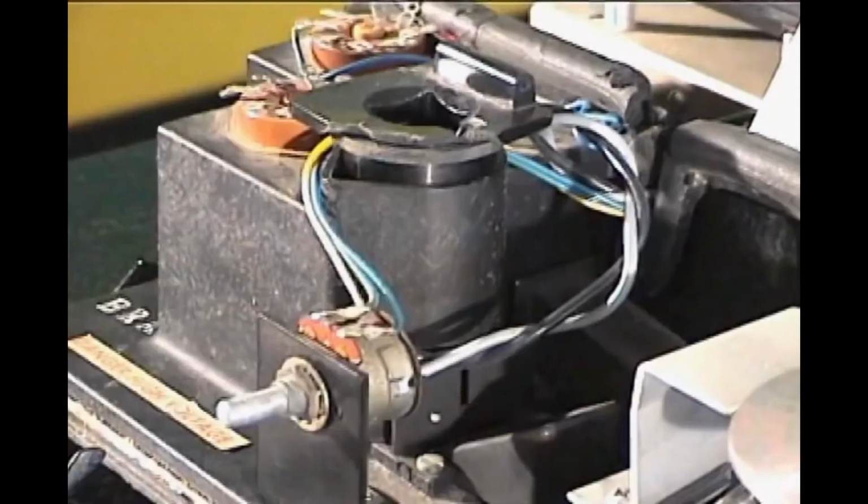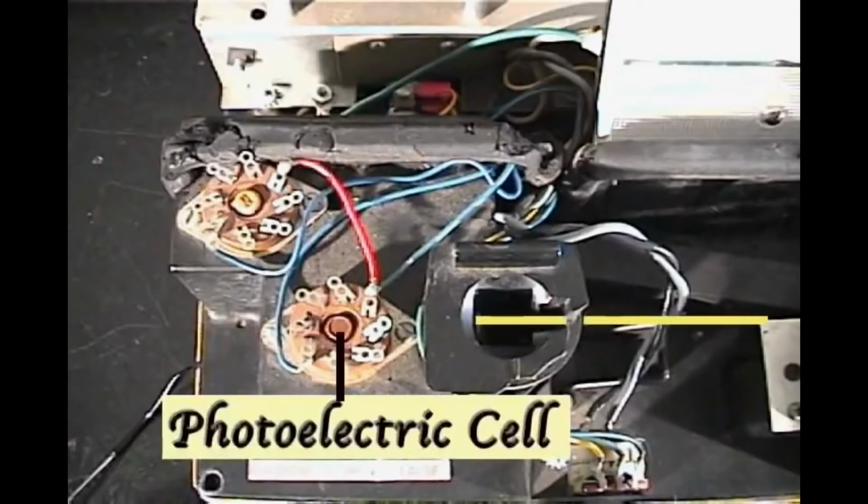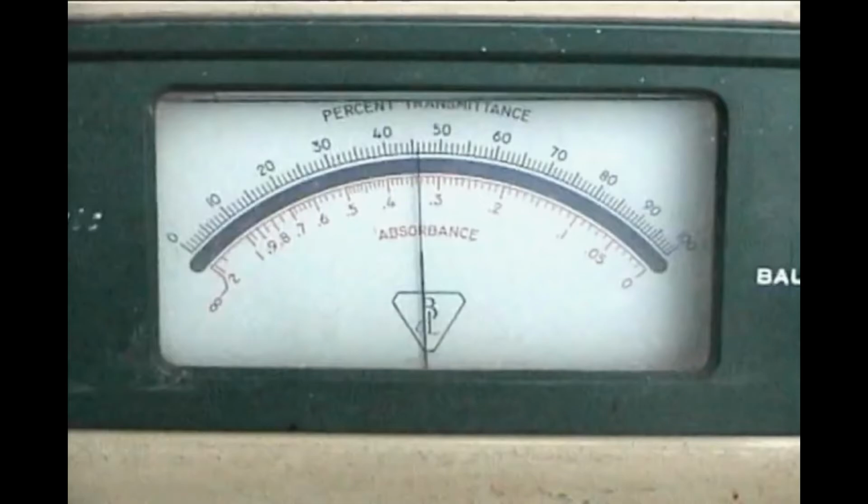Turning the dial rotates a cam that causes an arm to twist the position of the grating. This allows a narrow range of wavelengths of light to pass through a slit and into the sample. Some or all of this light is absorbed, and the rest is transmitted to a light-measuring photoelectric tube that causes a response in a meter.